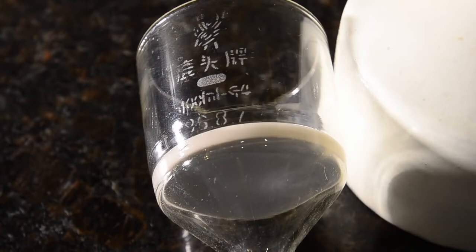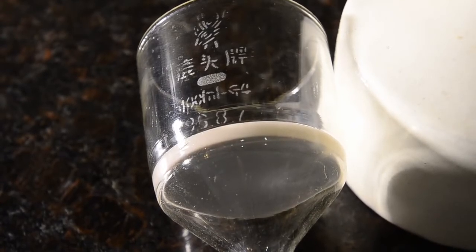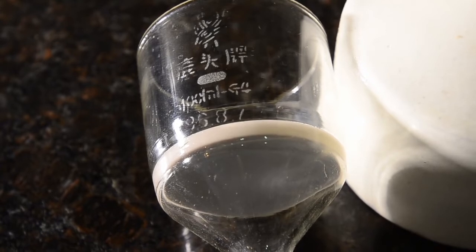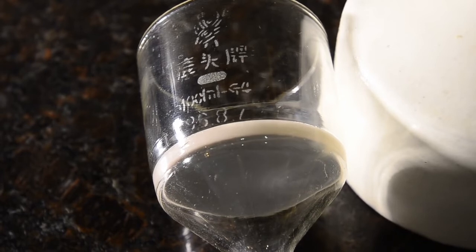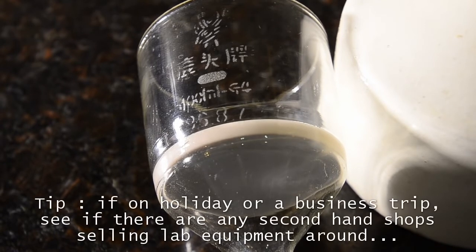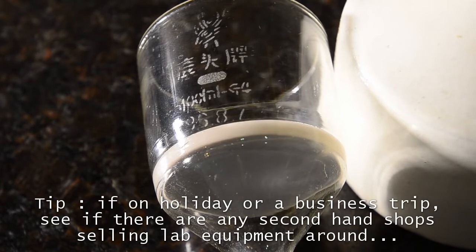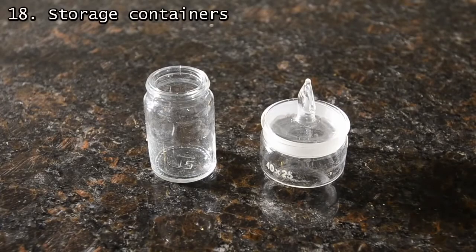It has a porosity grade of 4, which means it filters much slower but can handle finer precipitates, such as the nanoparticle copper powder we produced in another video. We picked up our filtration flask whilst on an overseas trip and smuggled it back — holidays and business trips to unusual locations can be useful for stocking your lab.